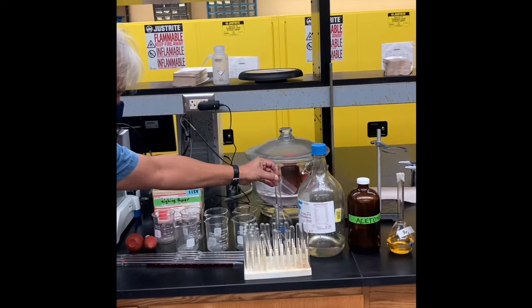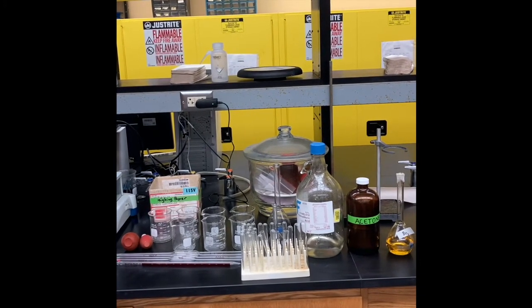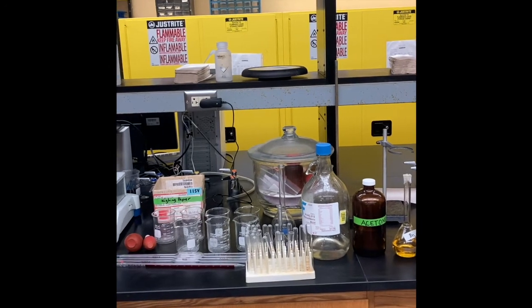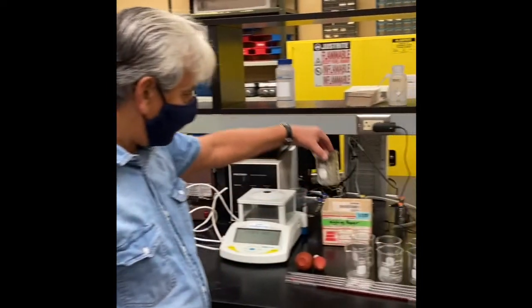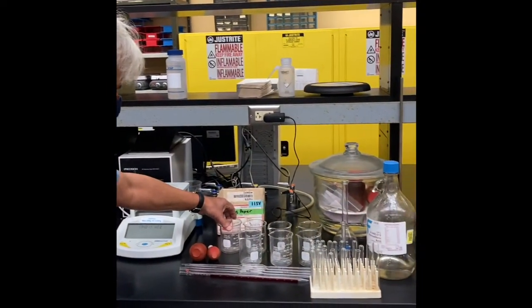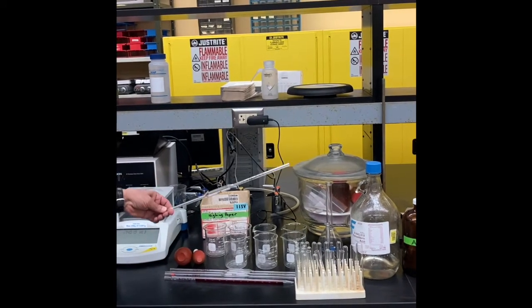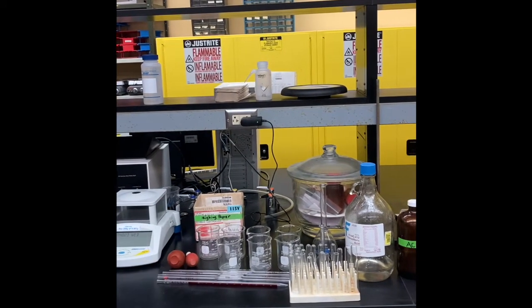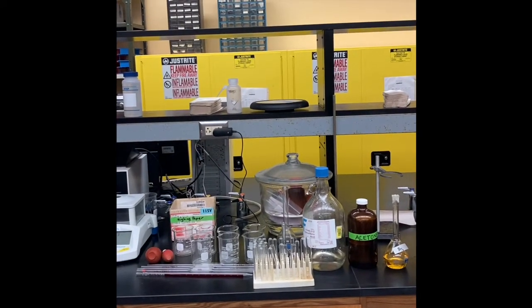Once stock solutions are ready, we prepare 7 different solutions of hydrochloric acid and acetone. We use this glassware to prepare these 7 different solutions, and we use these volumetric pipettes to add different amounts of hydrochloric acid and acetone.